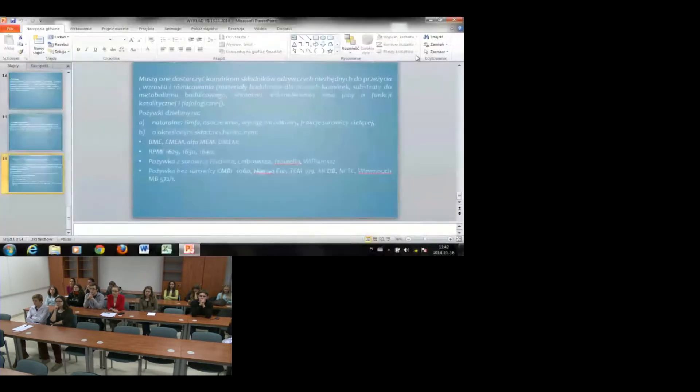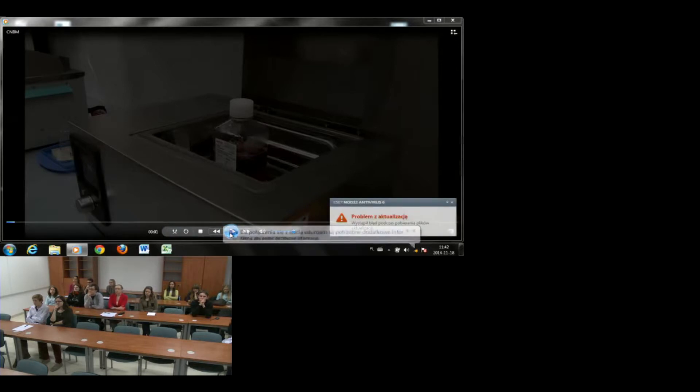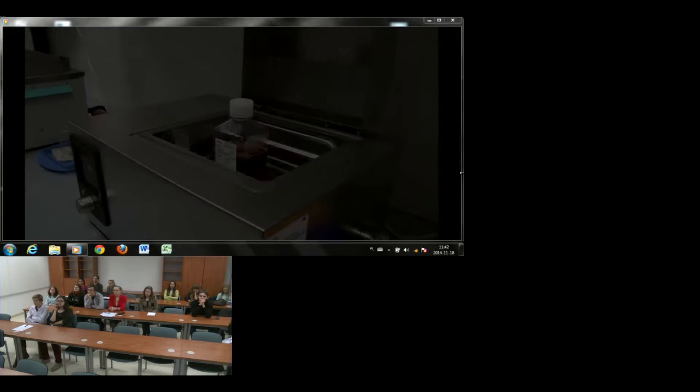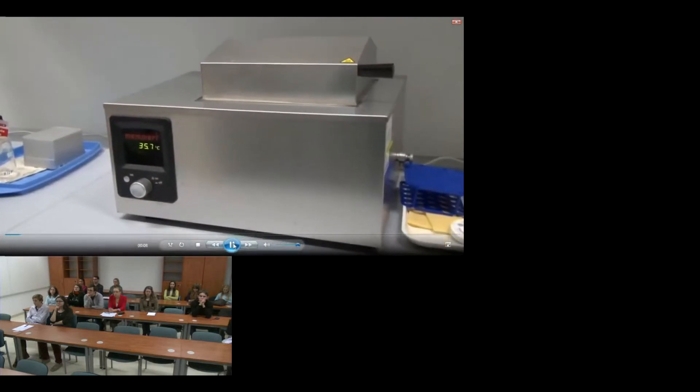Teraz zostanie zaprezentowany krótki film instruktażowy dotyczący pasażowania komórek, czyli przenoszenia komórek z jednego naczynia hodowlanego do drugiego, najczęściej w celu redukcji ich liczby. Zanim przystąpimy do pracy z komórkami, trzeba pamiętać o dwóch podstawowych elementach. Pierwszym jest podgrzanie medium, czyli pożywki hodowlanej, do temperatury 37°C — musimy to uczynić godzinę przed rozpoczęciem hodowli.